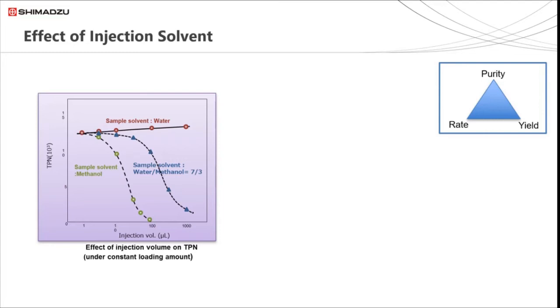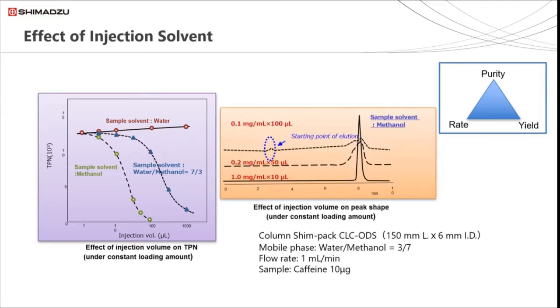We can see the effect of this in real chromatograms. There are 3 shown here. All use 100% methanol as the injection solvent, but the top chromatogram is 100 microliters, the middle 50 microliters and the bottom 10 microliters. The chromatogram with only 10 microliter injection shows a reasonably tight narrow peak.